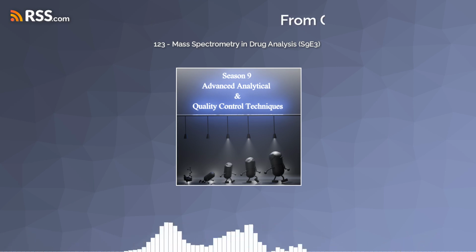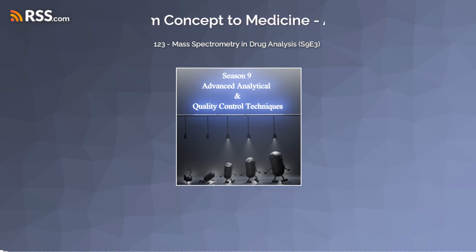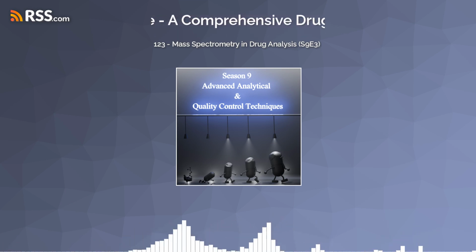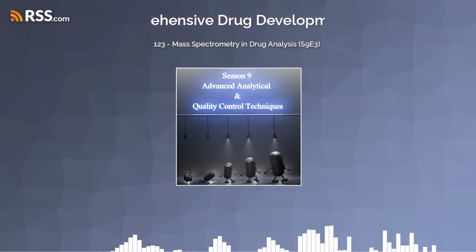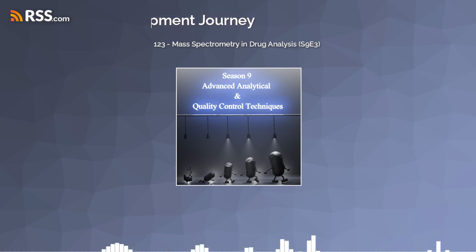Perfectly put. The instrument you choose depends on the complexity of the sample and the level of detail you need. Are we looking for a specific known impurity, or are we trying to identify a mystery byproduct? The answer will often guide us towards a particular type of mass spectrometry.